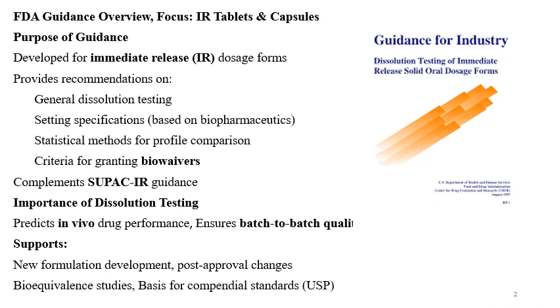Also, it provides the insights that the processes are consistent and the product is robust as the dissolution is similar across the batches. It supports new formulation development and it supports the post-approval changes. Many of the times the biowaivers can be granted considering the dissolution testing. Bioequivalence studies and the basis for the compendial standards. USP monographs are there, which provide you the requirement of the dissolution testing.